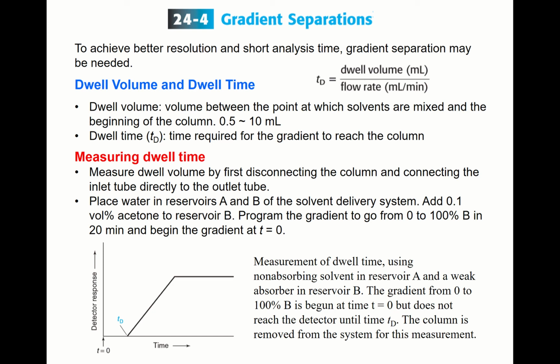Anyway, the important part in liquid chromatography is that different solvents are input to the column, and the ratios of each solvent are continuously changed.